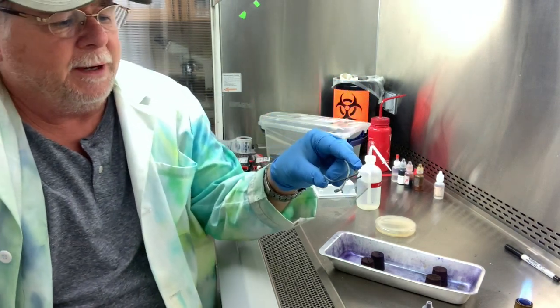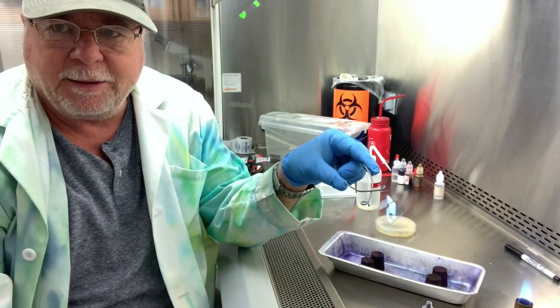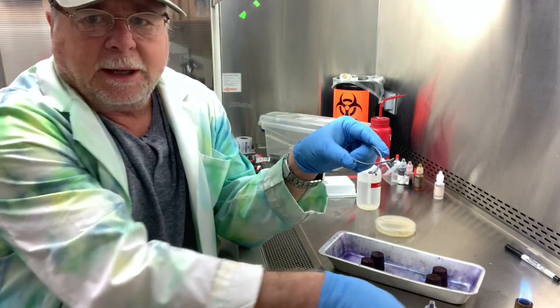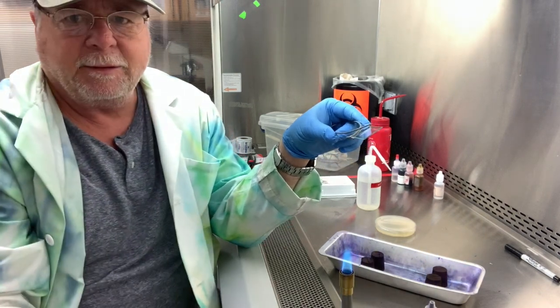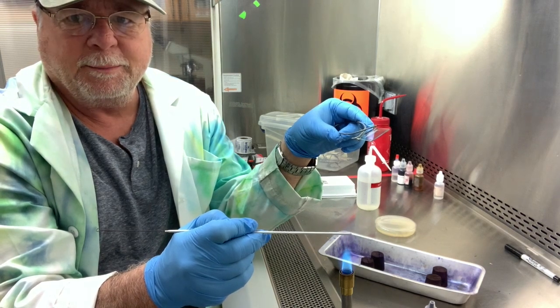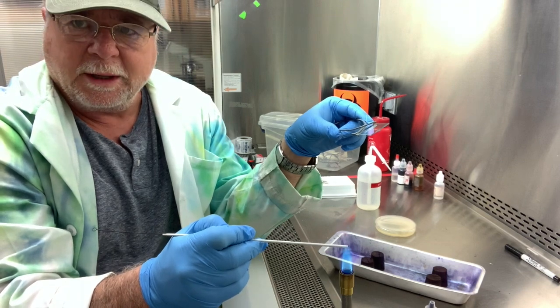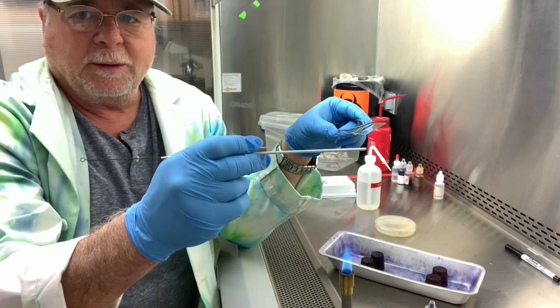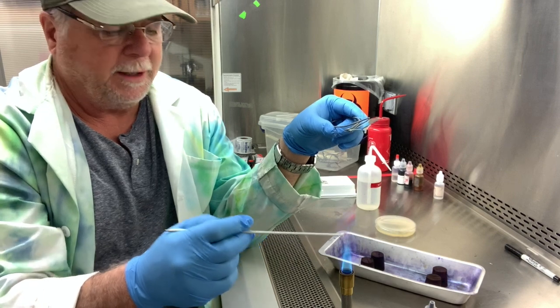And then once we have it air dried, then we have to heat fix it. What heat fixing does is kill the bacteria and stick it to the slide. And so we're going to put it in the burner. We're going to pass it through the flame. And we want it just about a half inch or an inch above the inner blue flame. This inner blue flame right here is really hot, so we want a little bit higher, but not too high. We don't want it way up here. So maybe about a rule would be about an inch above this tip of the blue flame.